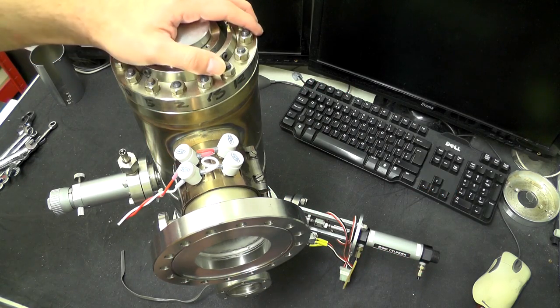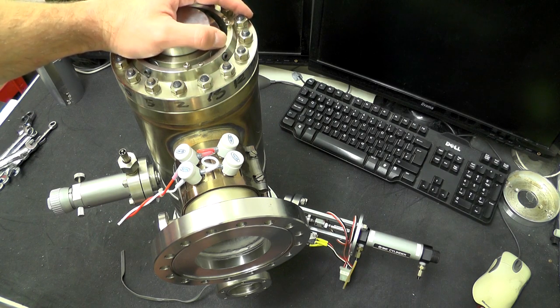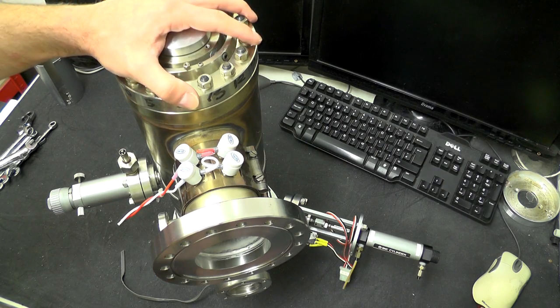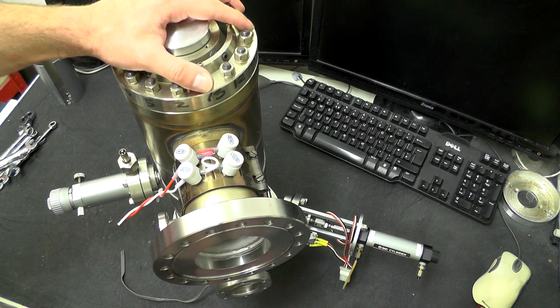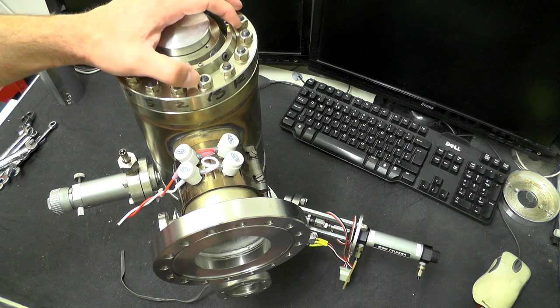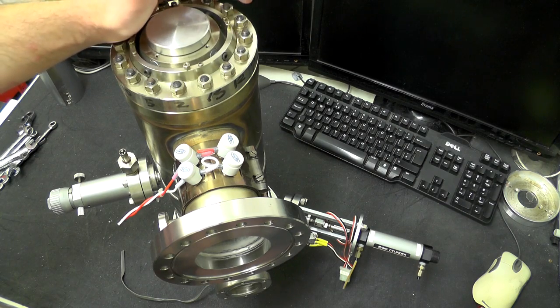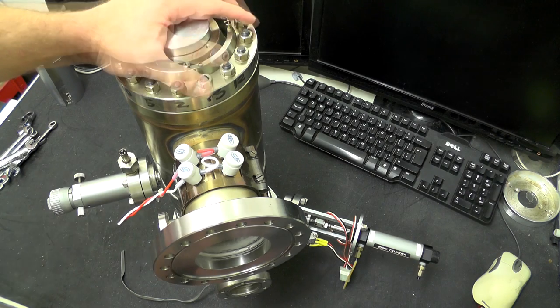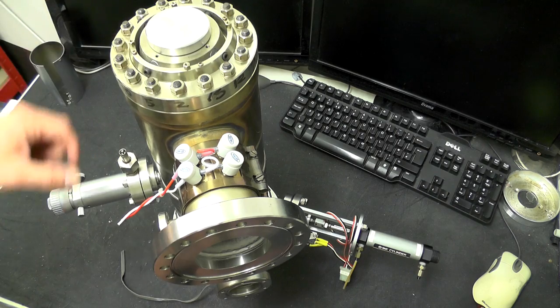Hello viewers, welcome back to part two of the SEM teardown. I just want to follow up with a few details from the previous video. A lot of the stuff I want to give away for free, and a number of people have already been in contact. There's quite a lot of it going to be disappearing off to a few different countries, including somebody with an identical machine who wants to restore it to working condition.